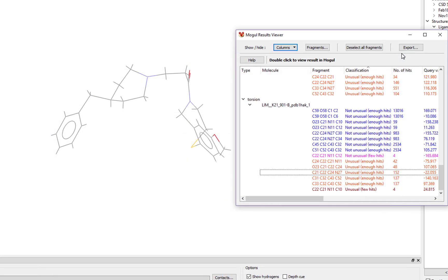Simply because a parameter is highlighted as unusual does not mean that it is wrong. It means that there is something interesting going on in the structure, and it is up to you as the crystallographer to investigate it. It may be that a hydrogen bond or other steric interaction is causing the molecule to adopt a strained conformation.